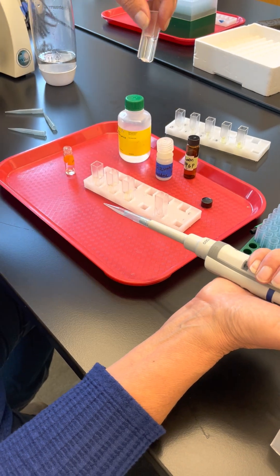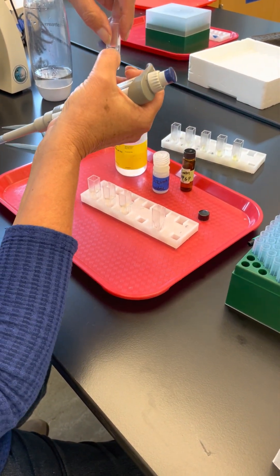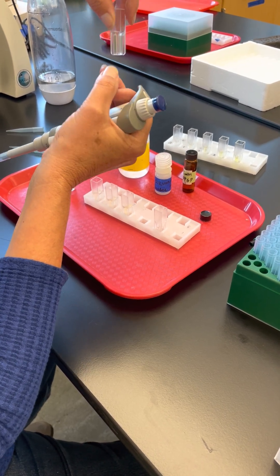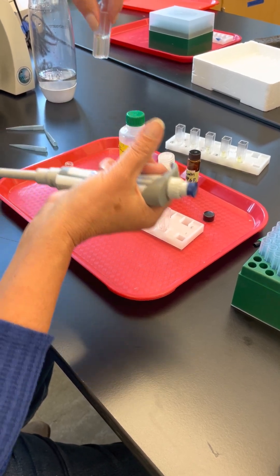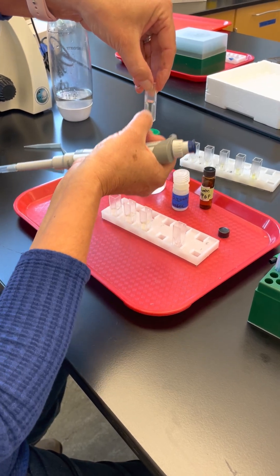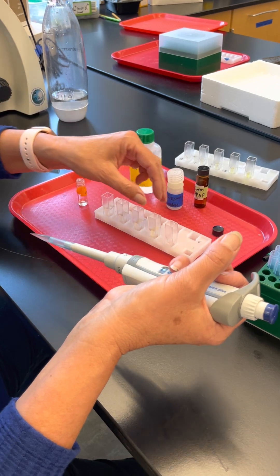The cuvette has a clear area on one side and an indentation on the other. You want to insert the cuvette so the flat, clear area is facing you. You can hold the top of the cuvette, but avoid touching the clear sides, because that's the area the spectrophotometer reads through.